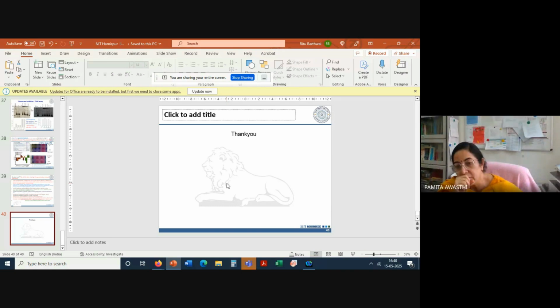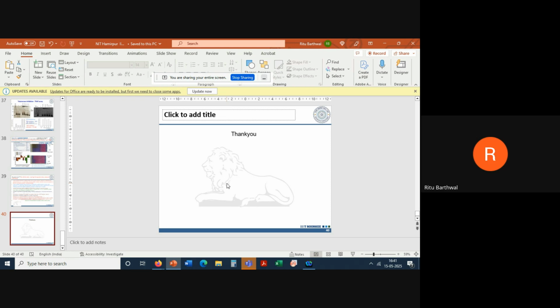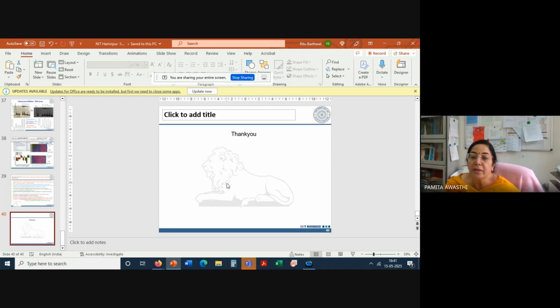UV-visible and fluorescence titration only let us know about the conformational changes; they do not give a complete idea about the atom-to-atom interaction. However, I'm still confused because recently there is some finding. They say that if you reduce the fraction of sp3 hybridization on the molecules, the binding to the quadruplexes is better than the class of anthraquinone antibiotics.